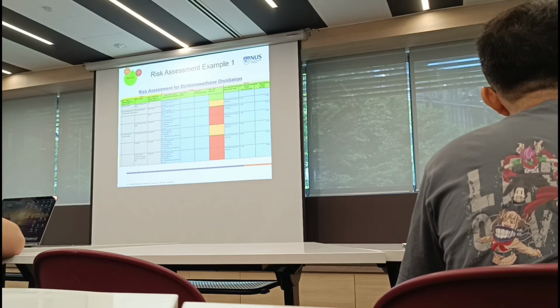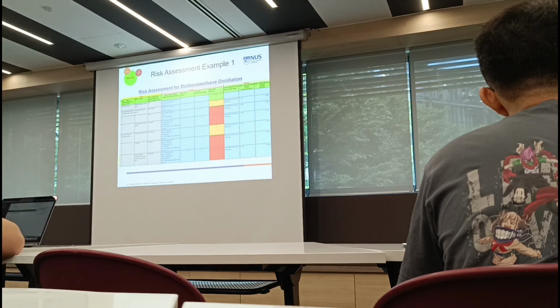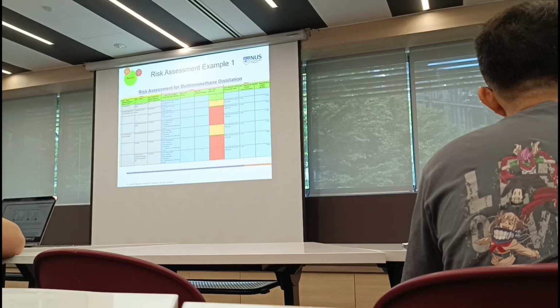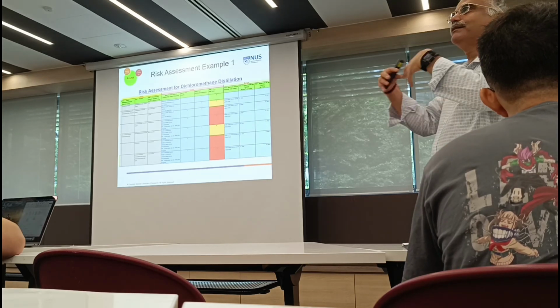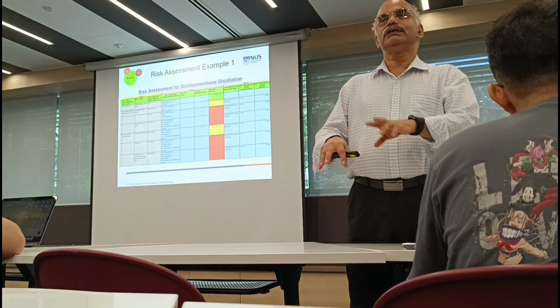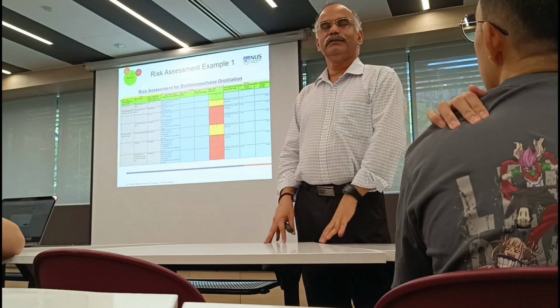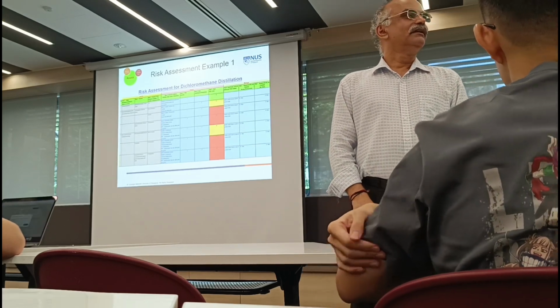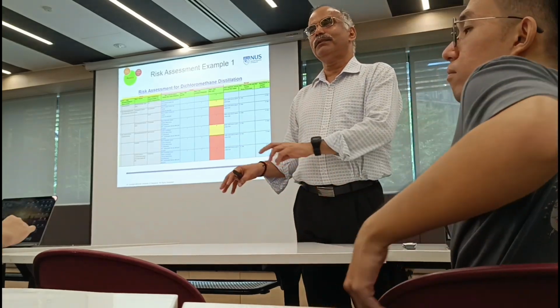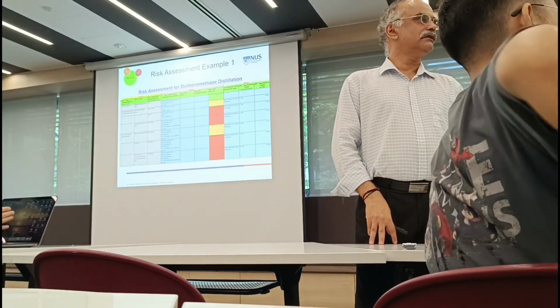And if you are not so sure, ask for help. You don't have to always do everything by yourself. There is always help provided. Now, again, as I mentioned, when I say help, you can either go to the safety lead, and if he or she is not cooperative, then go to a professor, and if he or she is very busy, then where do you go? You go to the department safety officer, right? He will definitely help you.